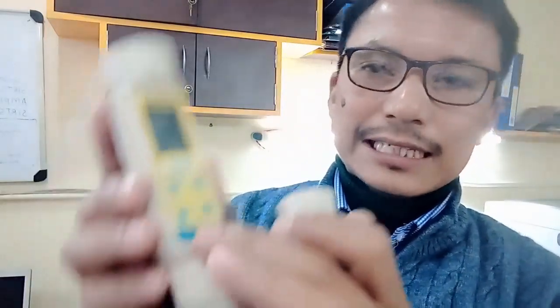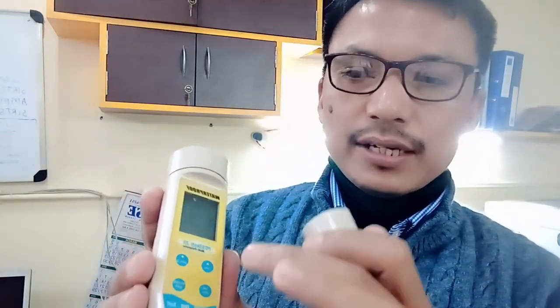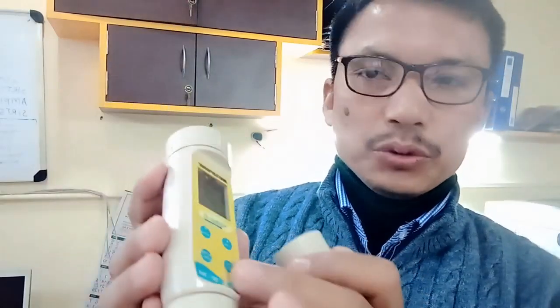Similarly, if you go for the salinity button, this button will give you the total salinity of the water. As you know, fresh water has almost nil salinity, but if you go to ocean or brackish water, you'll get some salinity level, and the ocean will definitely have a high salinity level. So if this button is used, we can directly get the total salinity of that particular water body. So that is why this multi-parameter portable device is used to measure all these four parameters.